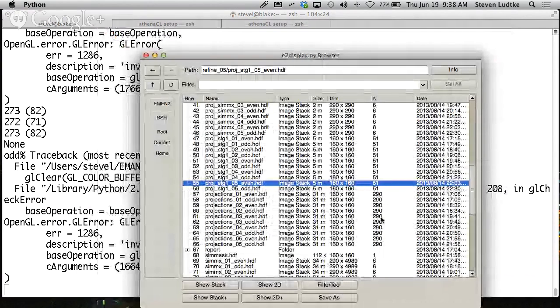It seems like I should be able to do something like the square root of the number, or the log of the number, if I'm going to do hierarchical classification. And indeed, that's what happens. We're doing something like that, but we don't think it's trustworthy.